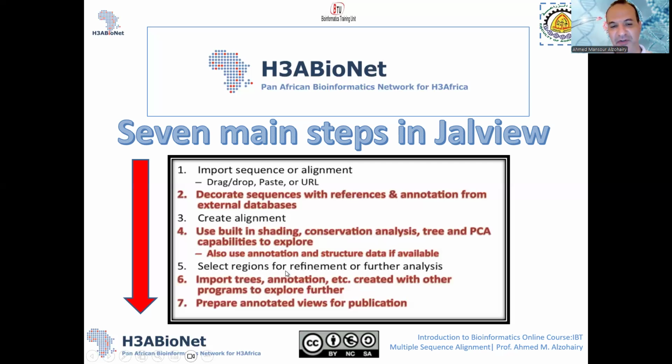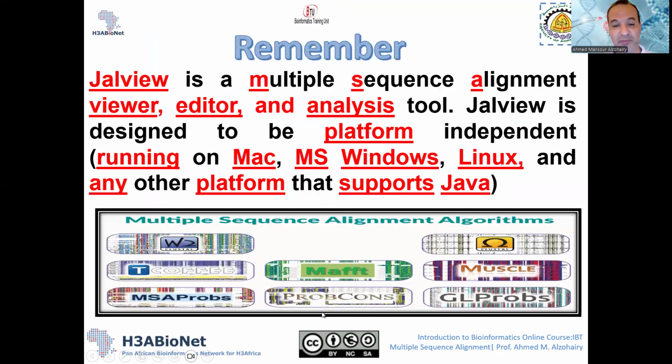Select regions for refinement or further analysis. Also import trees and annotation created with other programs to explore further, as we'll see in this lecture. Also prepare annotated views for publication.